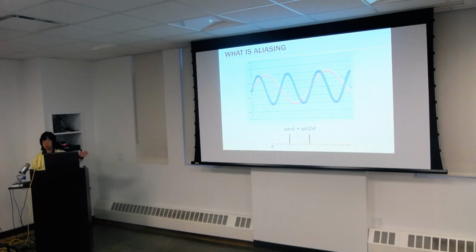And then if I do a Fourier transformation, as shown at the bottom, I will describe what I'm trying to do here with just two values, each at a different frequency, with an amplitude and a phase. Now, if we describe our Fourier transformation starting with a cosine function, which Grant did in his lecture, then both of these will have a 90-degree phase shift, right?